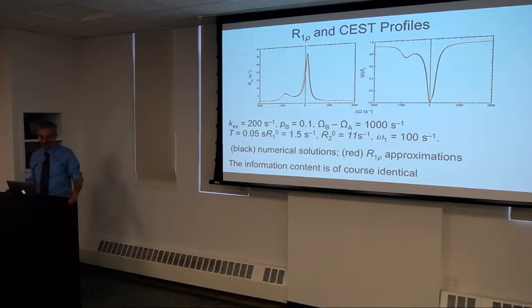What's the biggest mistake? In the beginning, the CPMG experiment was hard, and then suddenly it became easy. And for the R1 rho experiment, I would say the trickiest part is making sure the magnetization is well aligned with the effective field and that there's no heating.